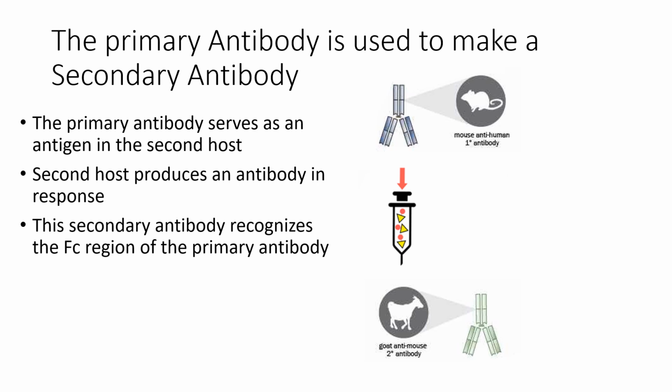Okay, in this case, the primary antibody is acting like an antigen. Okay, and that antibody that has been put into the goat is now forcing the goat to make its own antibodies against the primary antibody.